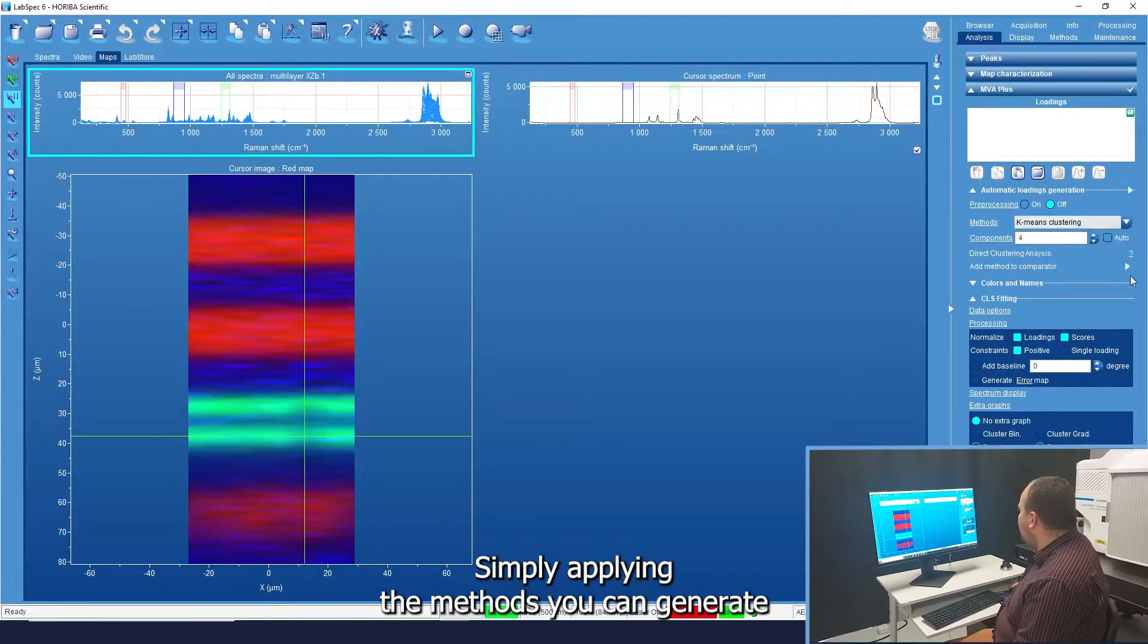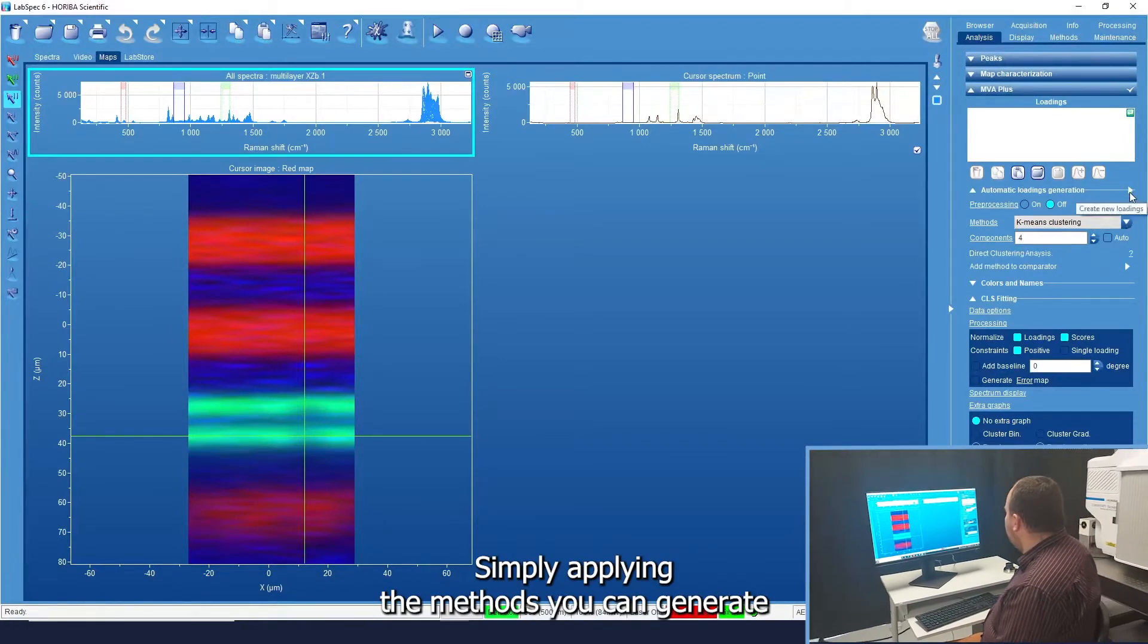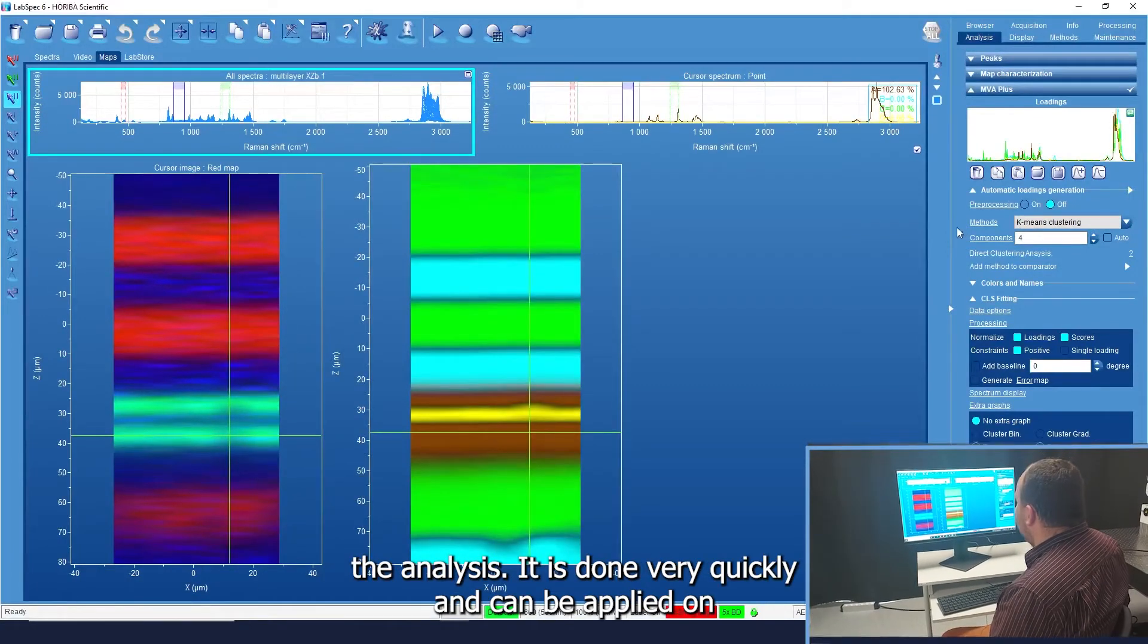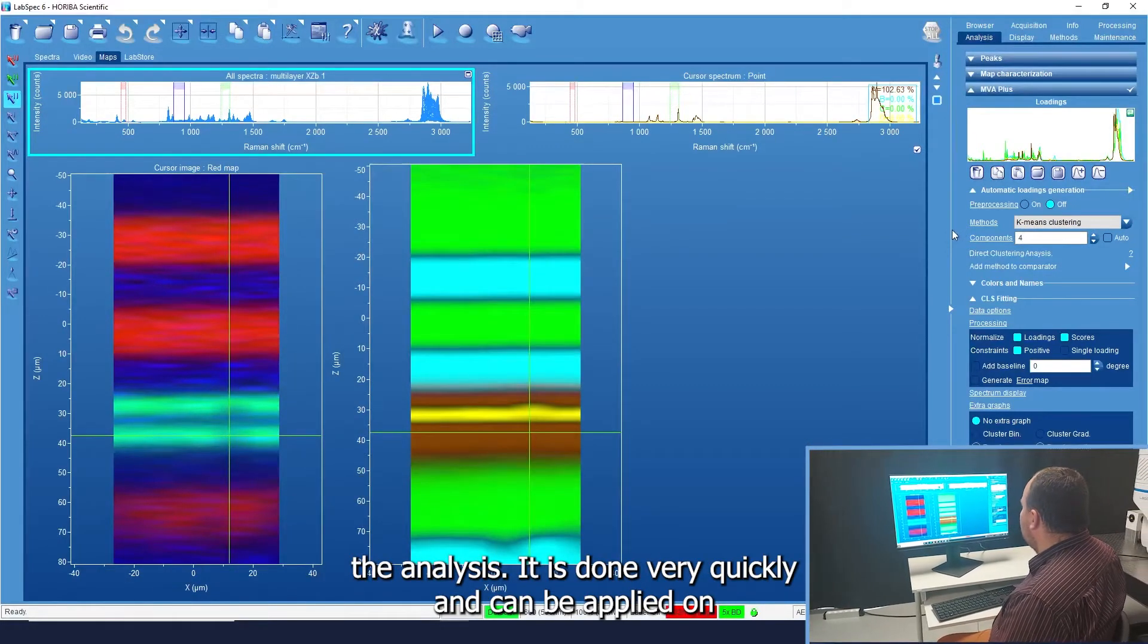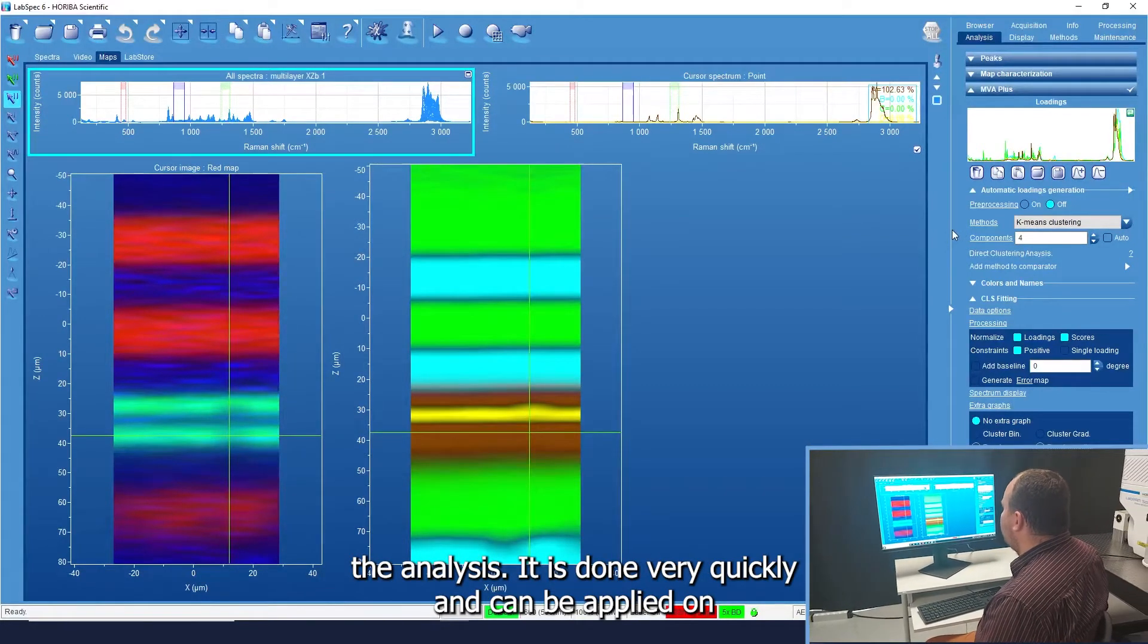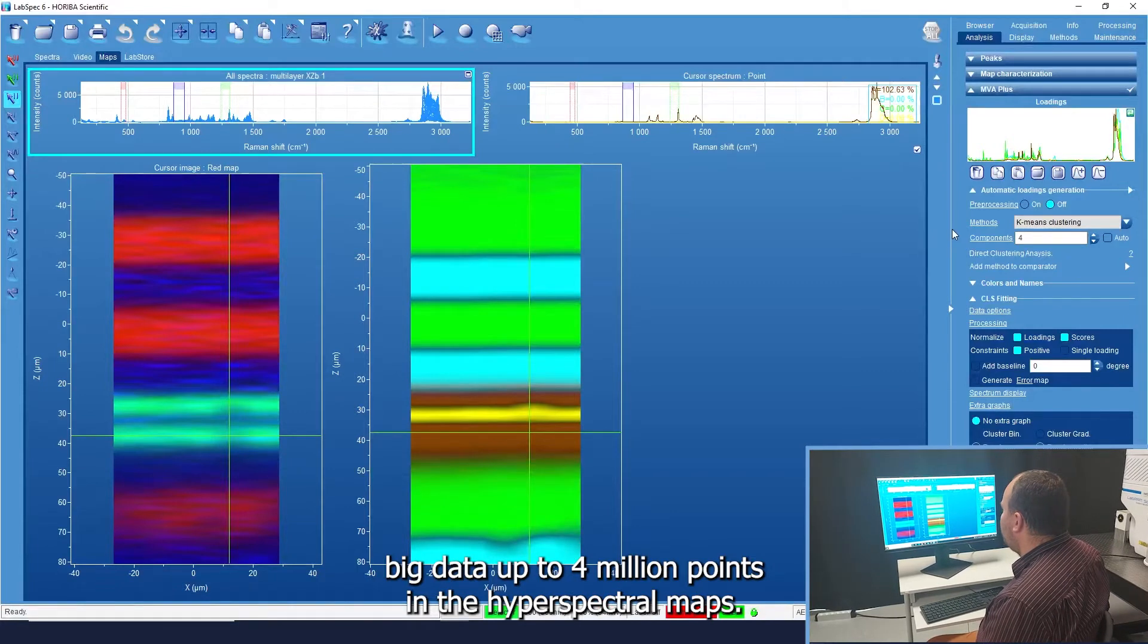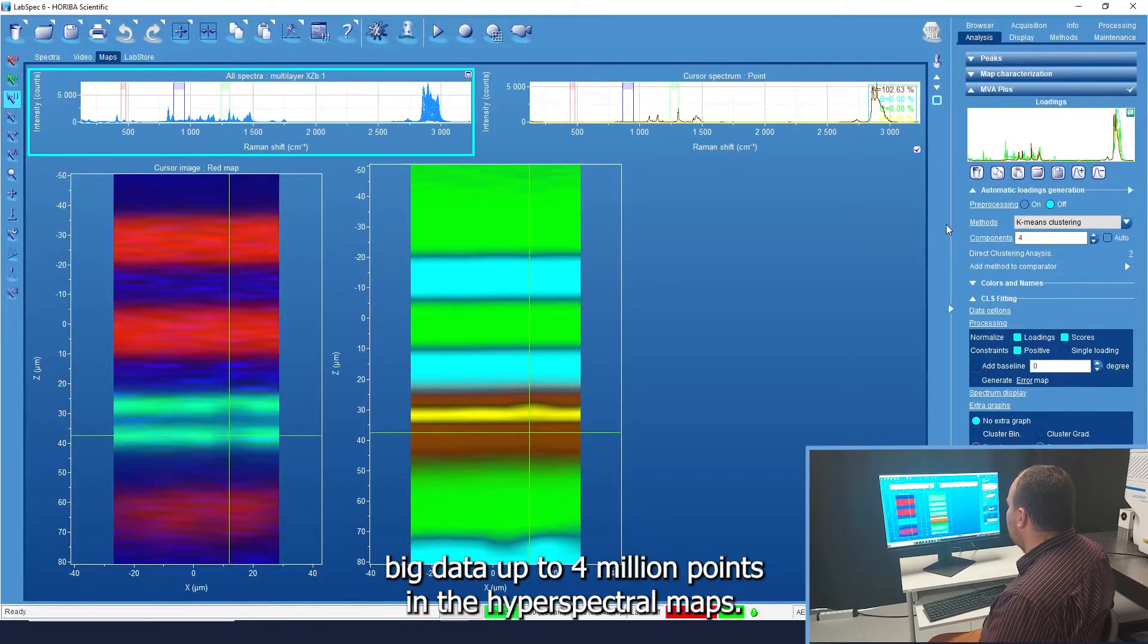Simply applying the methods, you can generate the analysis. It's done very quickly and it can be applied on big data that has up to 4 million points in the hyperspectral maps.